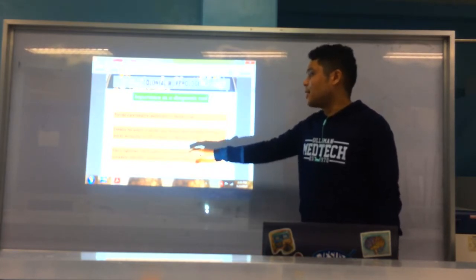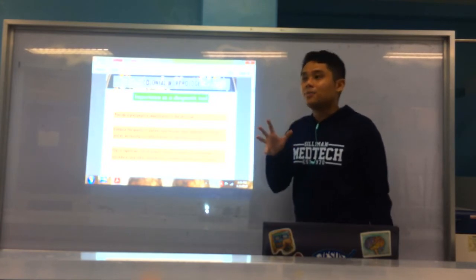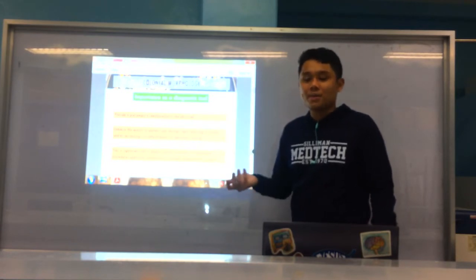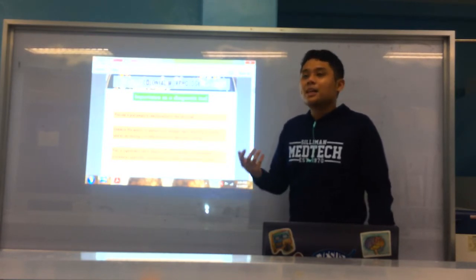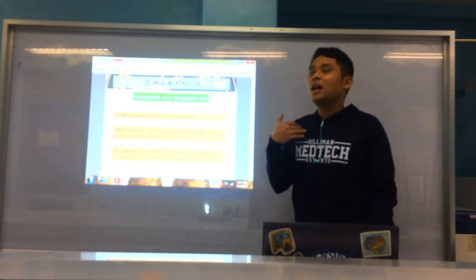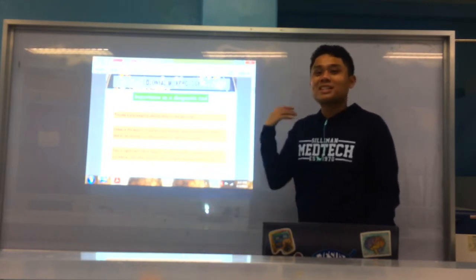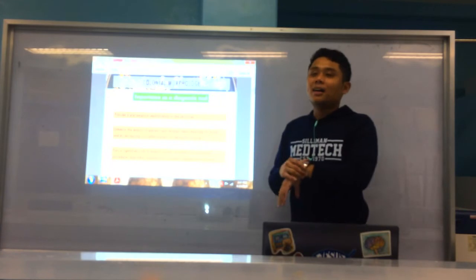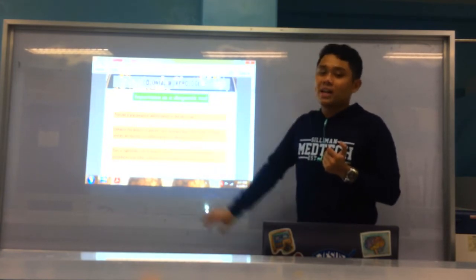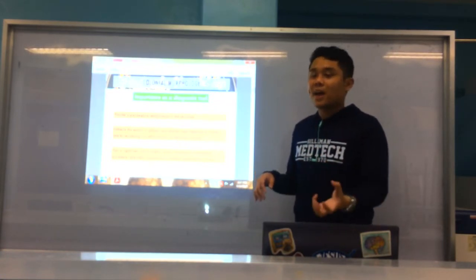Next, it enhances the quality of patient care through rapid reporting of results. Some bacteria have characteristic colony appearance or colony morphology, and through that, depending on the lab, some limit themselves to that and report the identity of the organism. But generally, we should not rely only on colonial morphology for identification. It's only a presumptive means of identifying your organism.